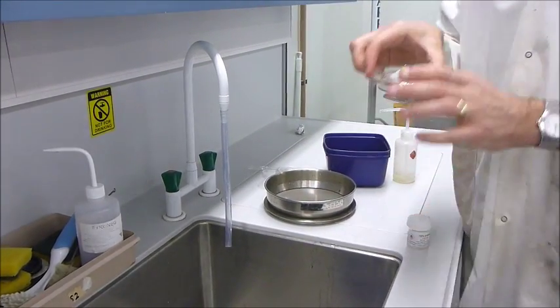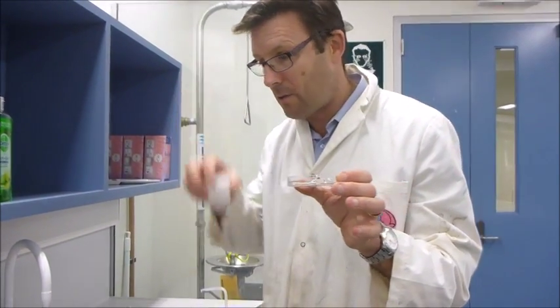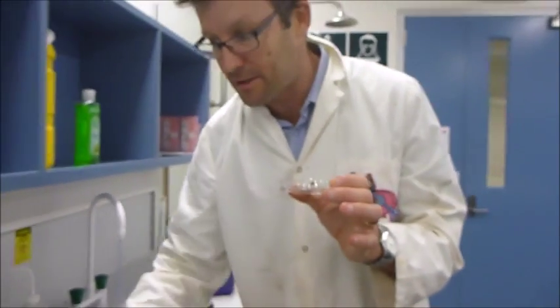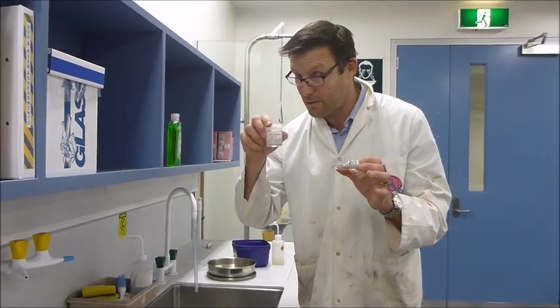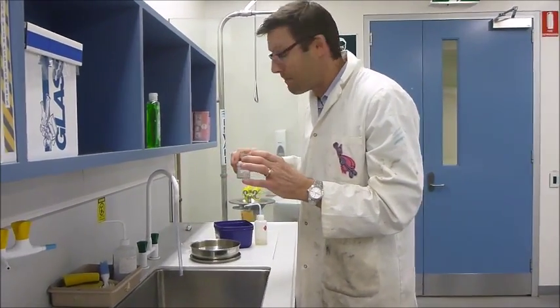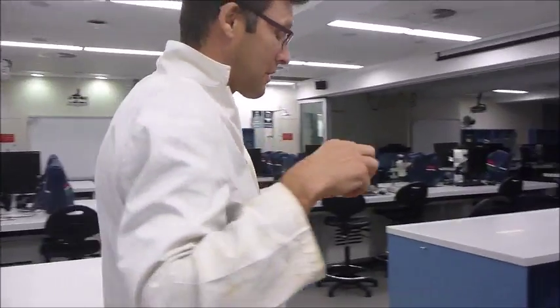So I now have my bugs all sitting in my petri dish with water and not ethanol. I haven't mixed together my rocks and my kick sample. No, we don't do that. That would be bad. So I'll make my way over to the microscope.